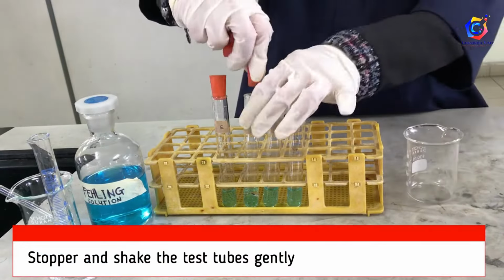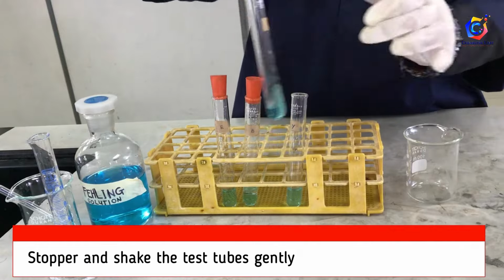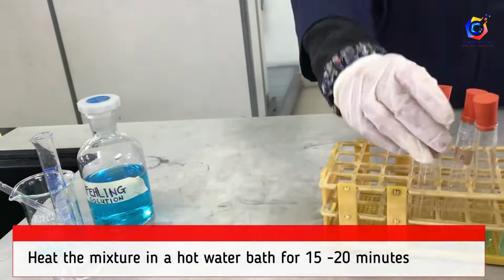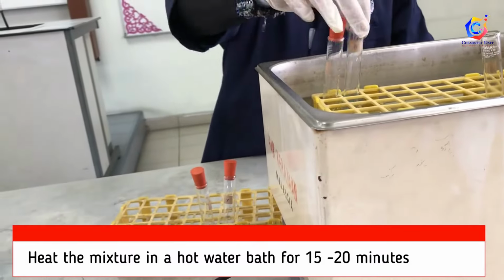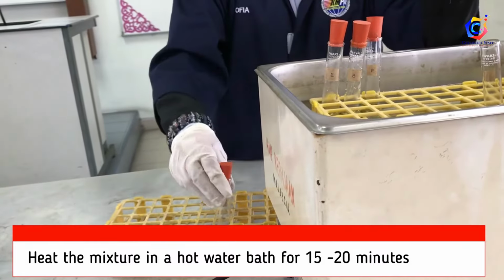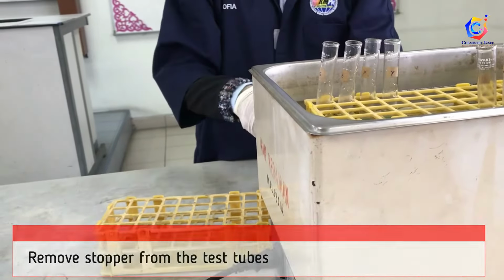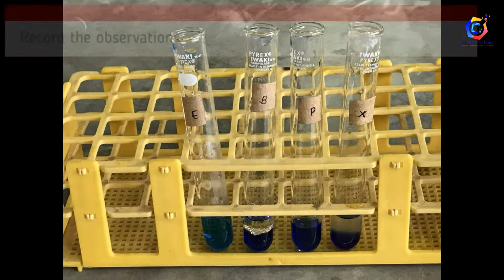Stopper and shake the test tubes gently. Heat the mixture in a hot water bath for around 15 to 20 minutes and record the observations.